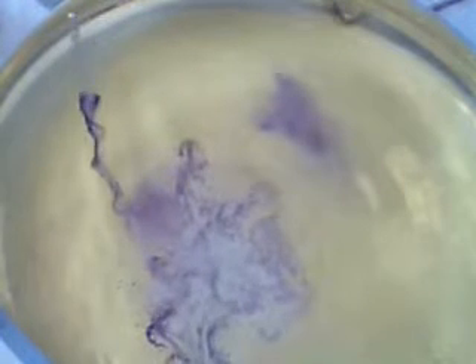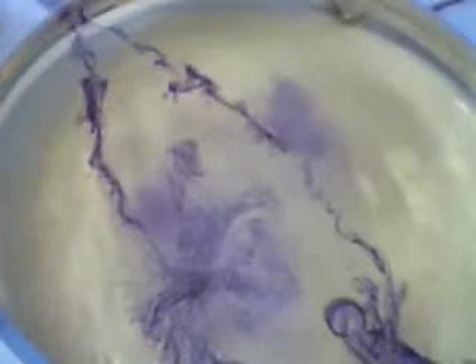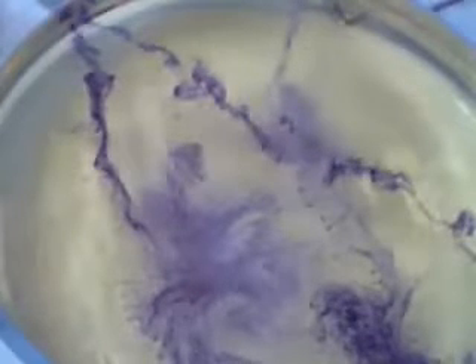This is sodium. Have a look — it forms into a ball, it zooms around, it colors the water where it goes, and then eventually it will pop. I have to keep it away from the sides, because if it explodes when it's near the sides, it can be a bit messy. But there you go — it forms into a little ball and zooms around.